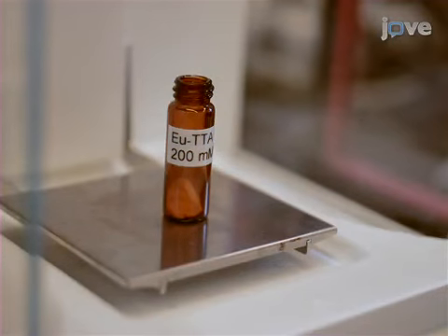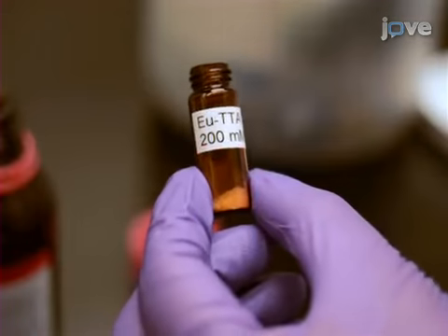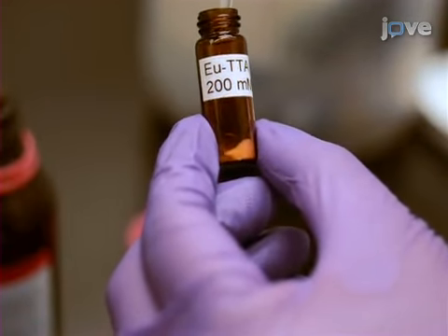Weigh the europium TTA in an amber glass vial and prepare a 200 millimolar stock solution in tetrahydrofuran. Mix gently by pipetting and visually verify that the dye is completely dissolved.